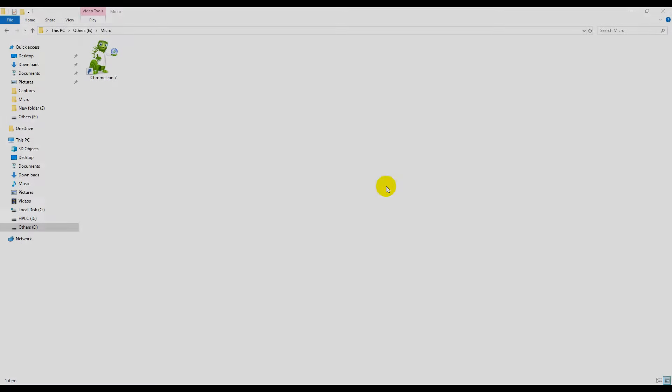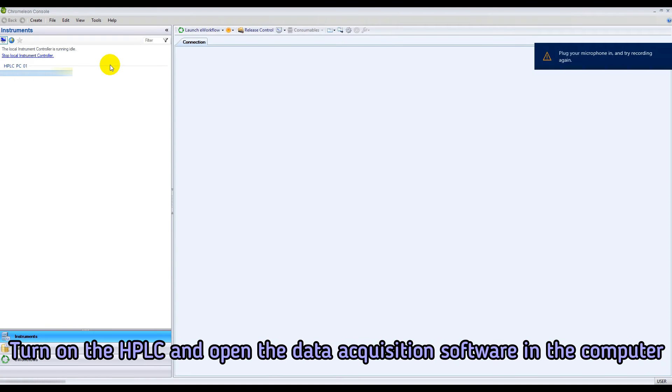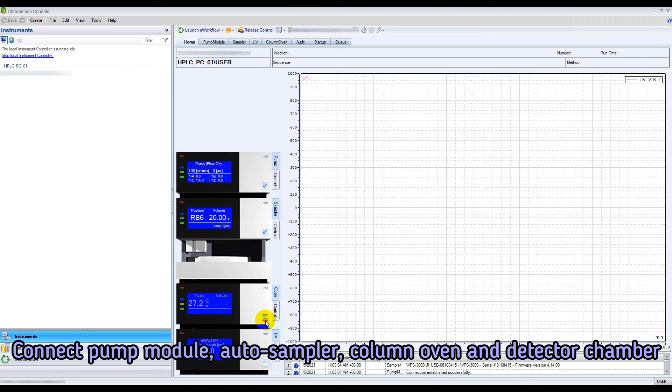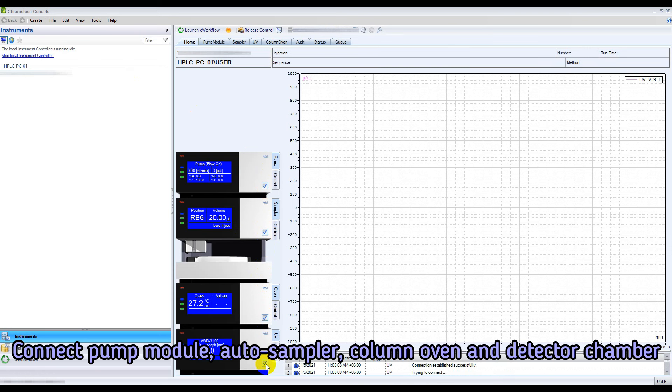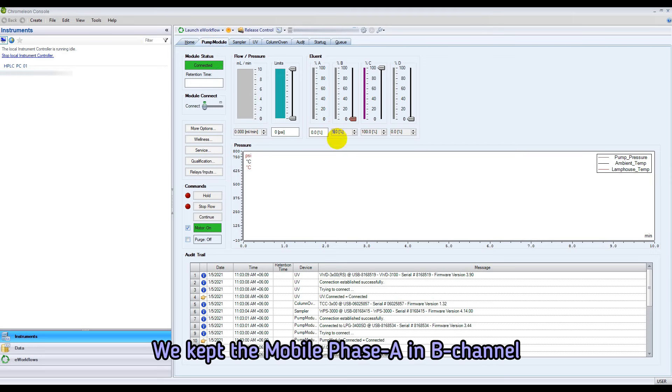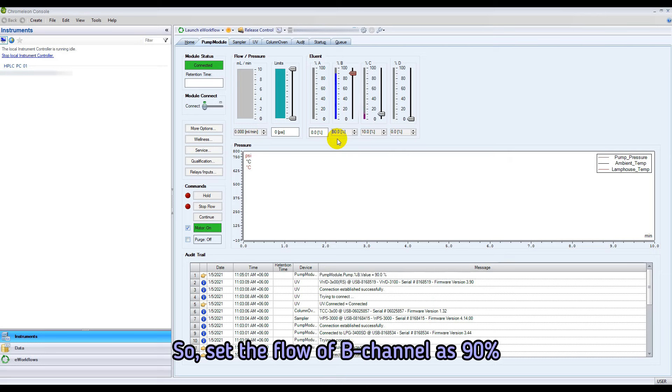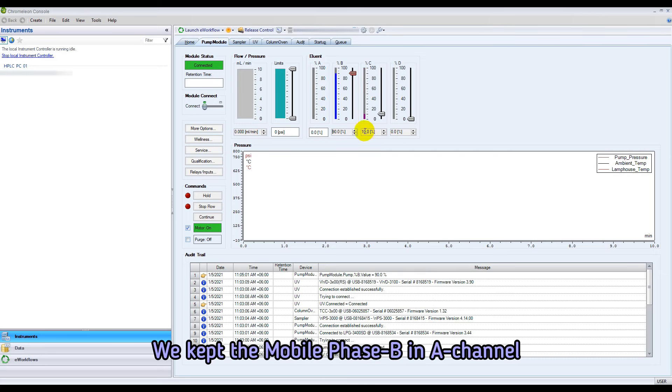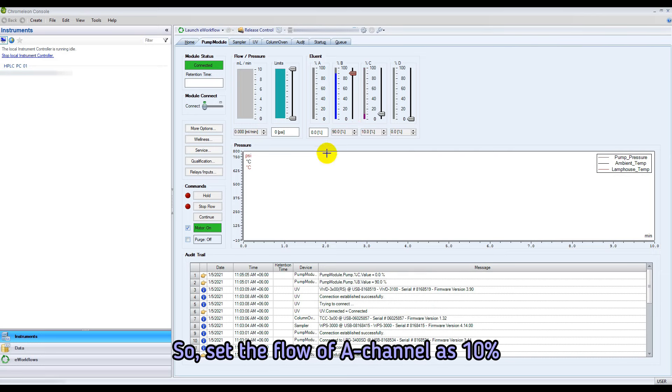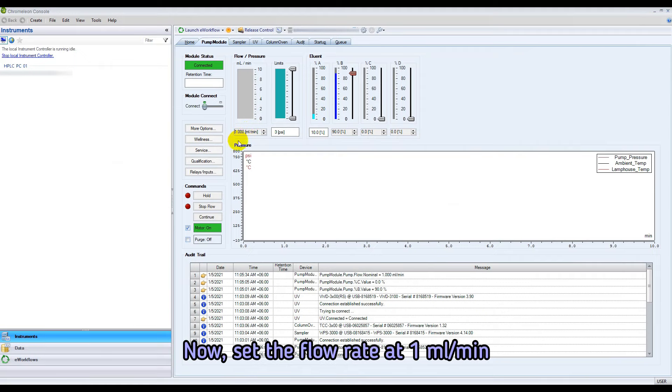Let's make the instrument ready. Turn on the HPLC instrument and open the data acquisition software in the computer. Connect pump module, auto sampler, column oven, and detector chamber. Set the mobile phase A flow at 90% and the mobile phase B flow at 10%. Set the flow rate at 1 ml per minute. Purge the flow if needed.